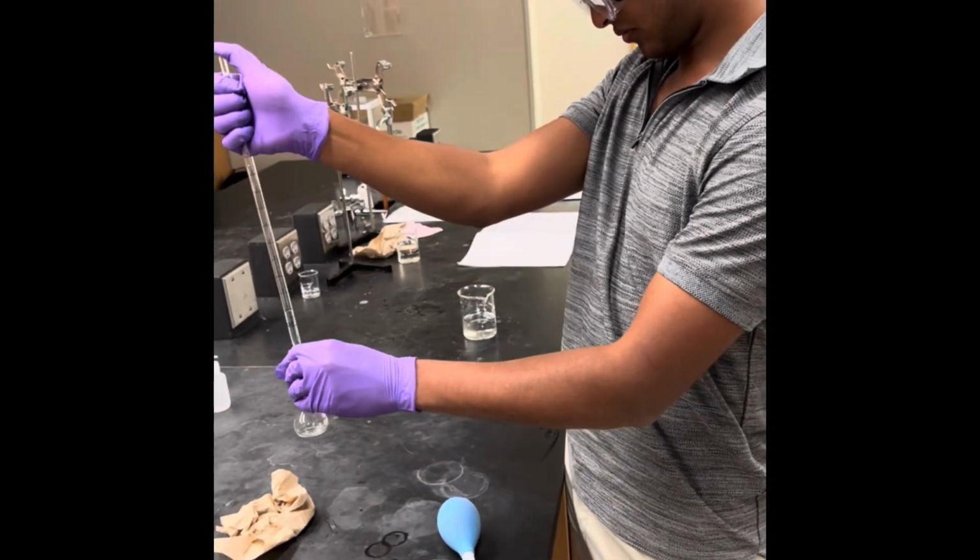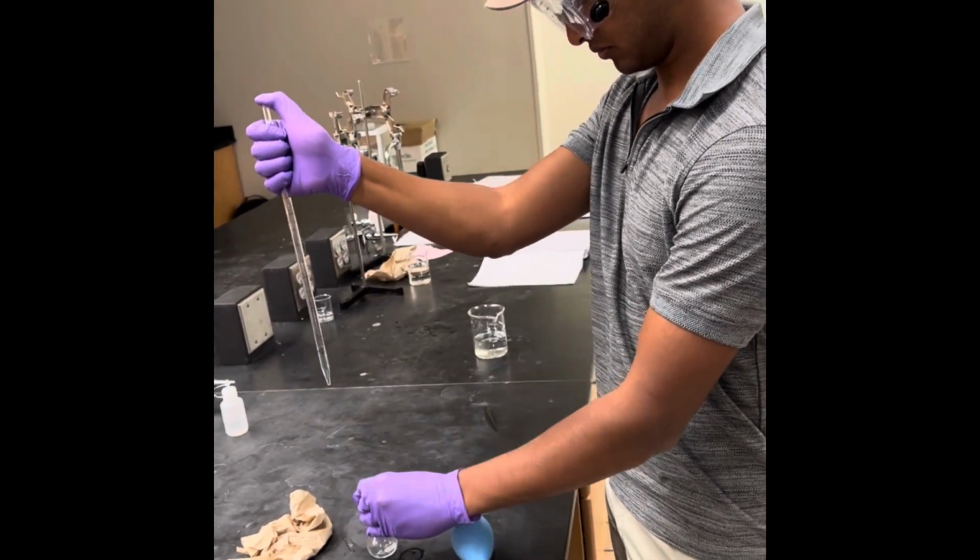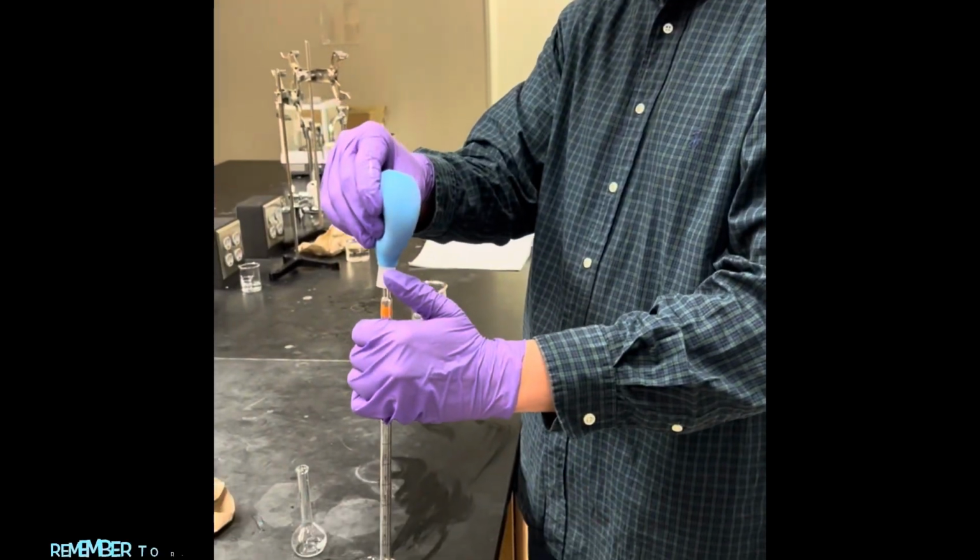The meniscus of the solution in the pipette is read by all group members before the solution is transferred.